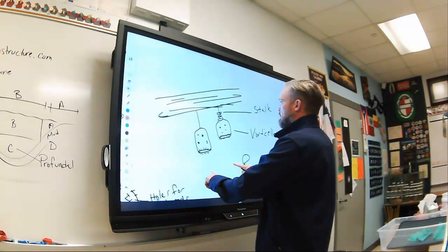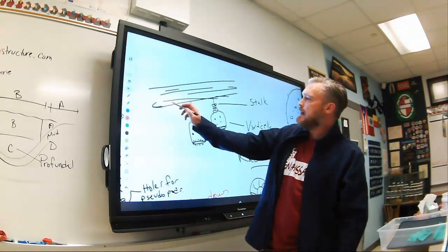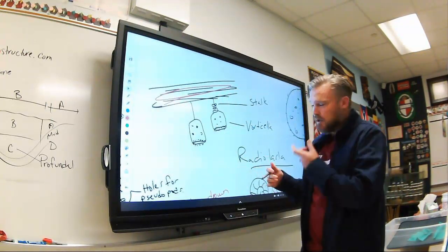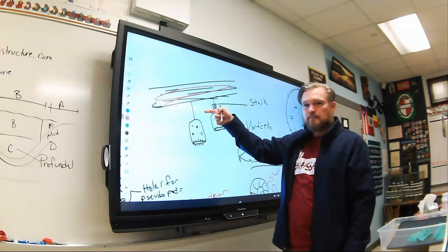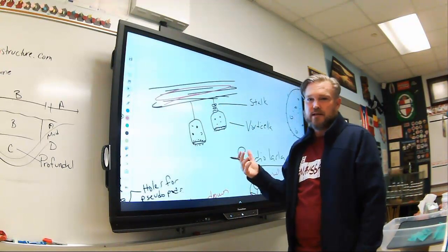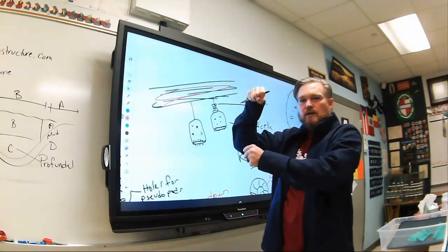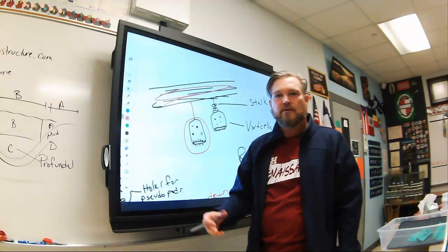Let me see if I can blow this up for you. So this would be a Vorticella right here. And usually what happens is if you have like debris, so like sticks or gravel or anything that's in a pond, these guys are freshwater as well. What they do is they have a stalk, right? And that stalk basically is kind of like a holdfast. So they stick to substrate, and then that stalk is long, and then their cell body is this bit here. So it looks like a tuba, kind of.